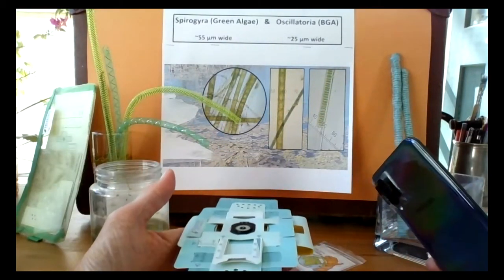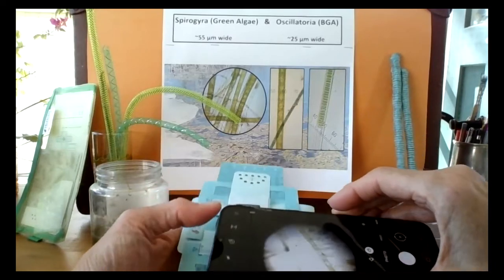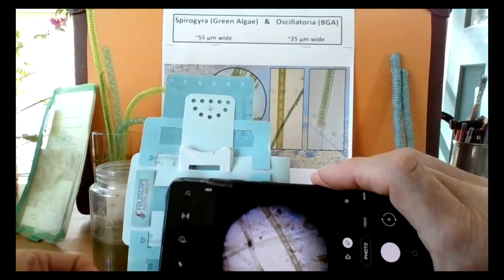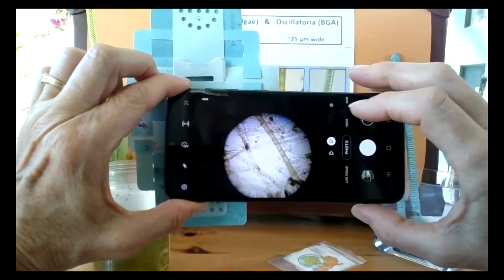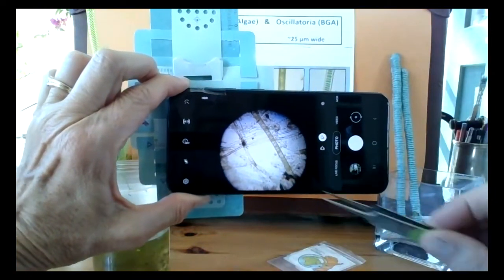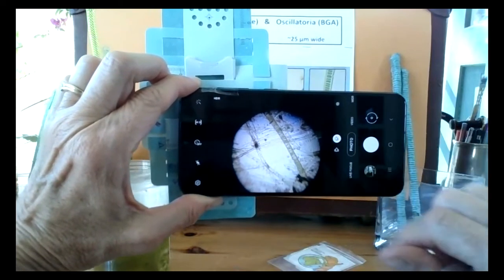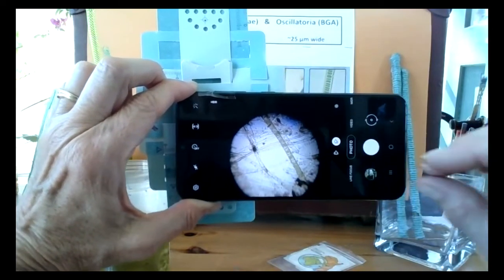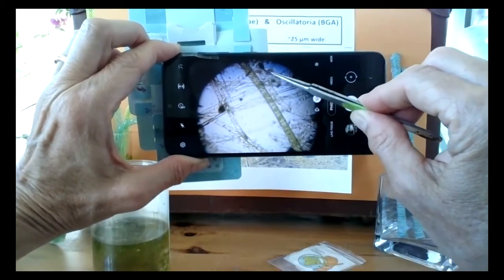So I have my sample on the foldscope. And as you can see, hopefully, that we have spirogyra here, and the number of filaments that are really not in very good condition there. Perhaps there's a little critter in there. That's probably a rotifer.